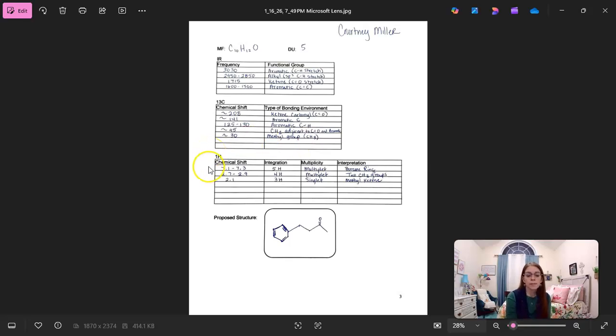The proton NMR spectrum shows 3 major signals. Between 7.1 and 7.3 ppm, there is a multiplet integrating to 5 hydrogens, which indicates a monosubstituted benzene ring. Between 2.7 and 2.9 ppm, there is a multiplet integrating to 4 hydrogens, which corresponds to two adjacent CH2 groups.